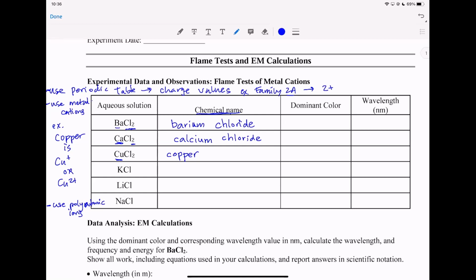Cuprous. Okay, that's Abby. So it is copper +1. Oh, sorry. Nope. Sorry. It was Yu Ying. It is copper Roman number 2 because this 2 had crossed over and down. So it's copper 2+ with the Cl-, and that's how this became CuCl2. Sorry, Abby, you'll get another chance. So this is copper with a Roman number 2, and then it still is the chloride.